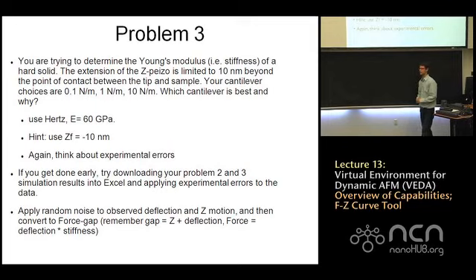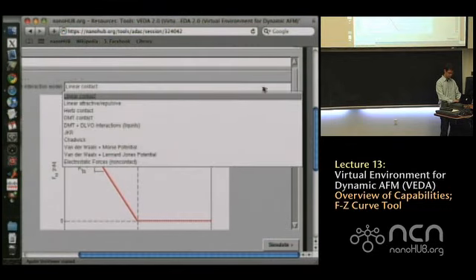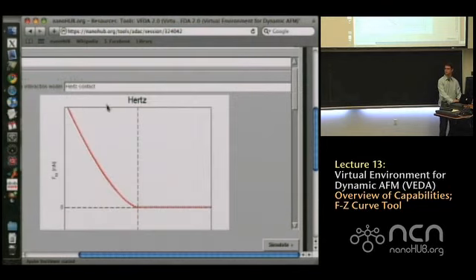And we'll do the 3 simulations for 0.1, 1 Newton per meter, and 10 Newton per meter cantilever. Okay? So use this model for your tip sample interaction. Somehow we got to clear everything you already.